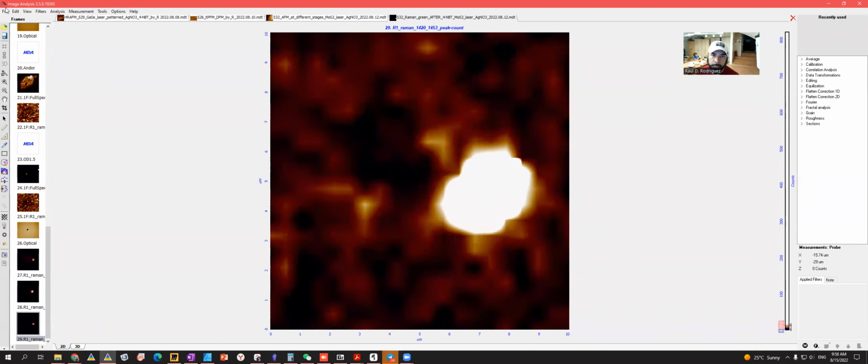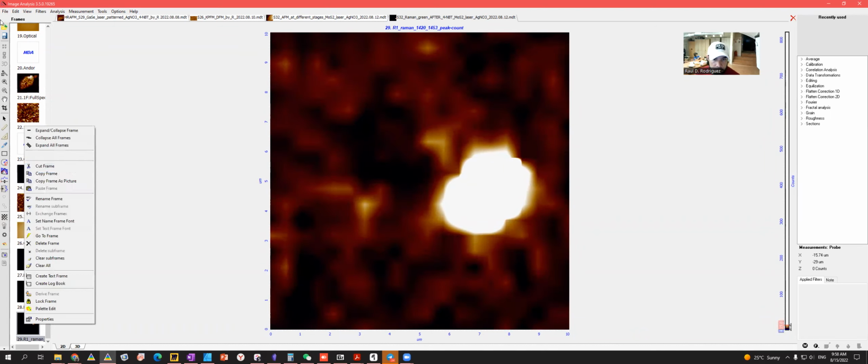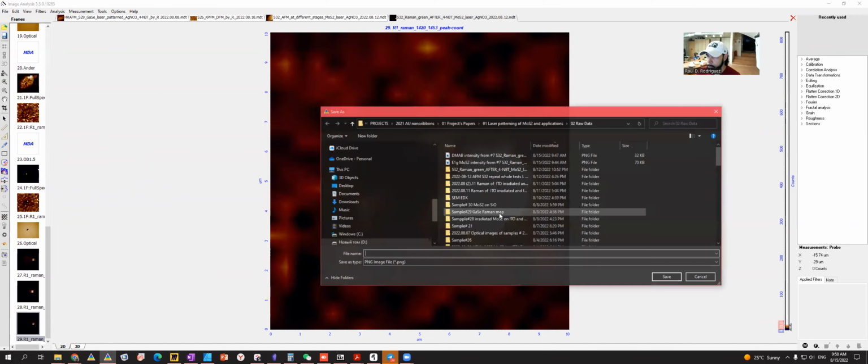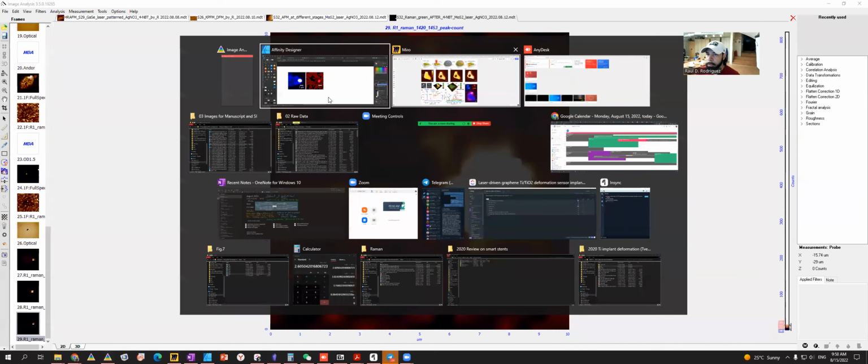And let's save it again. Export. And then you call it, this is DMV, or high contrast.